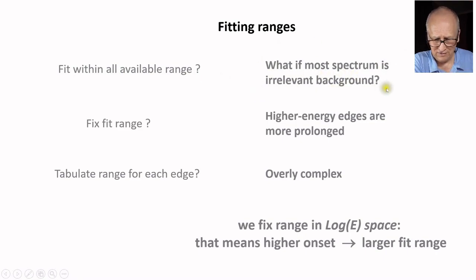Trying to model it, trying to include that correctly in the model would probably only increase the danger of artifacts. Maybe it's better to reduce somehow the fitting ranges.